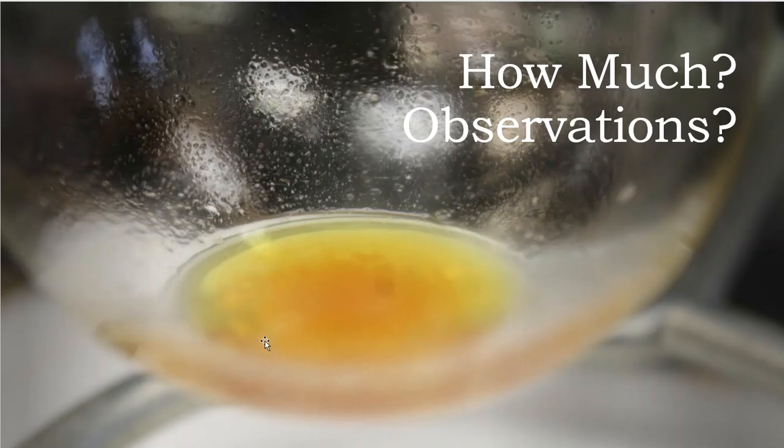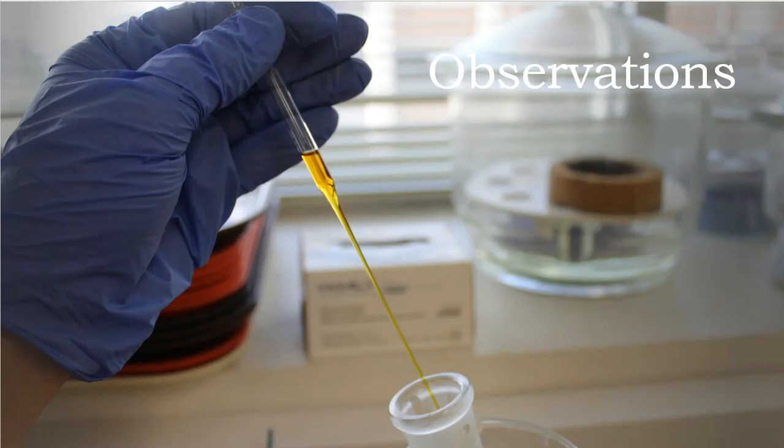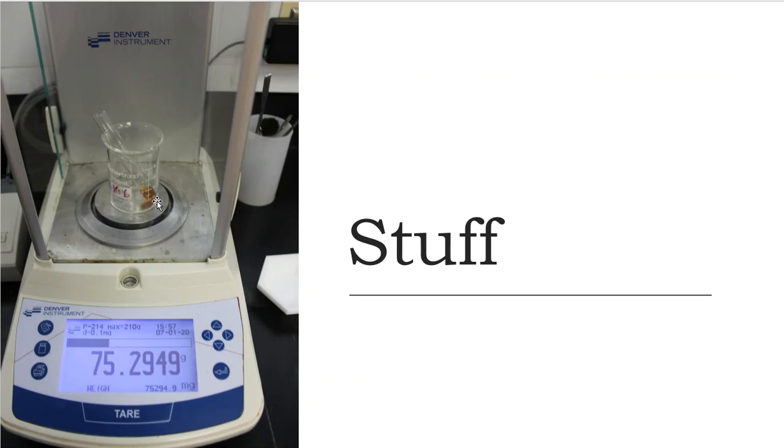So I'm going to take this residual. This is my hexanol. Whether it's 1-hexanol or 2-hexanol, that's for me to determine. I decided to take that boiling flask over to the balance and use a glass pipette to suck up the hexanol that I had made. So here is your observation for the final product. This is going to be one of those alcohols, I've just got to figure out which one it is. I'm going to directly add that into the test tube, and what you're going to see is a mass of 75.2949.